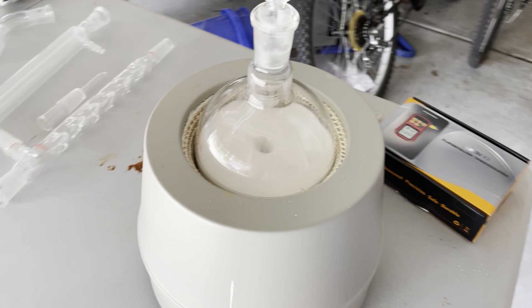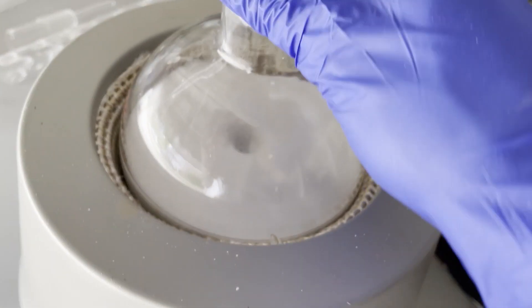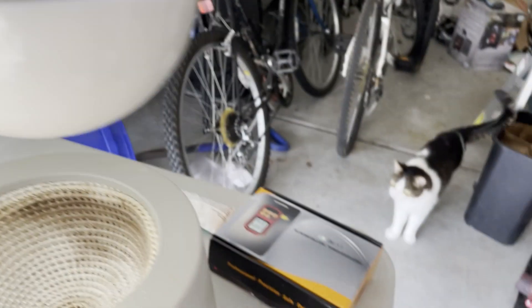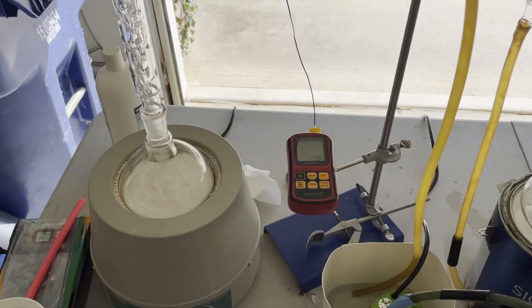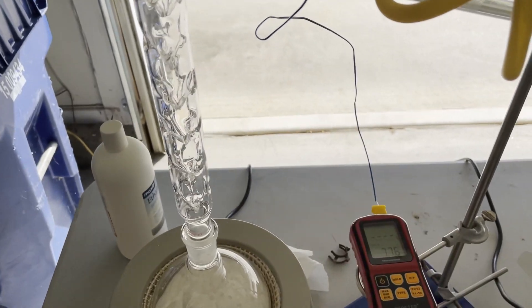So first things first, I added a bunch of excess calcium oxide and added that to around 500 milliliters of ethanol, which should be enough for the whole process. After stirring it for around an hour, I proceeded with the distillation. Now I obviously could have gone longer, but since I was doing the calcium carbide step, I wasn't too worried.